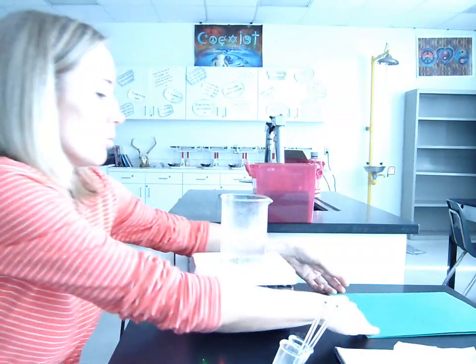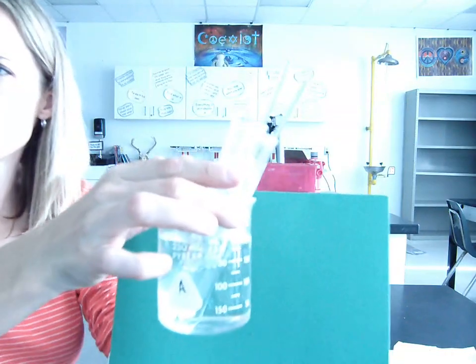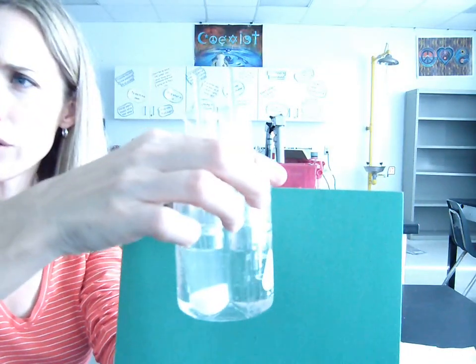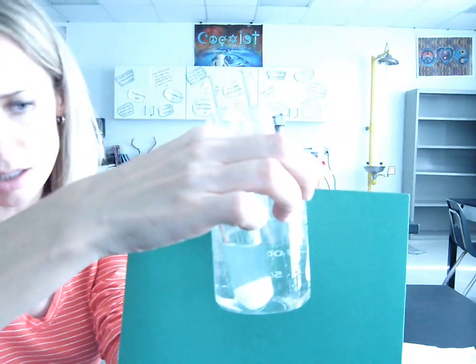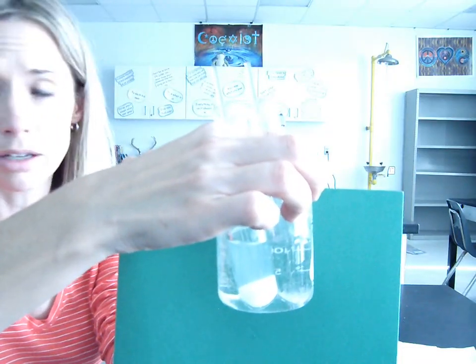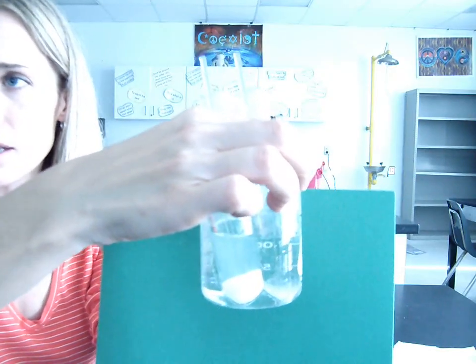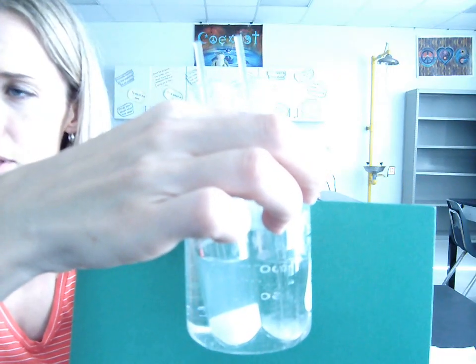I'm going to, hopefully without hurting myself here, try to hold this up so you guys can see what happens. Okay, oh, that's good. All right, so you can see substance A is on the left and substance B is on the right. I don't know if this is backwards to you guys or not, but substance A is the one that still has solid in it. Substance B is not. Watch what happens to substance B.